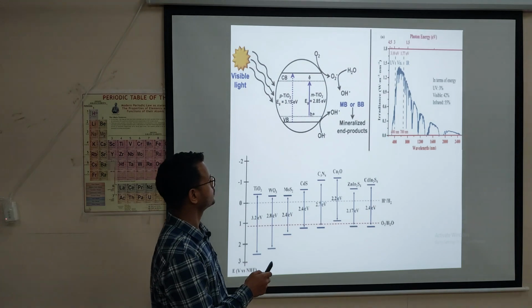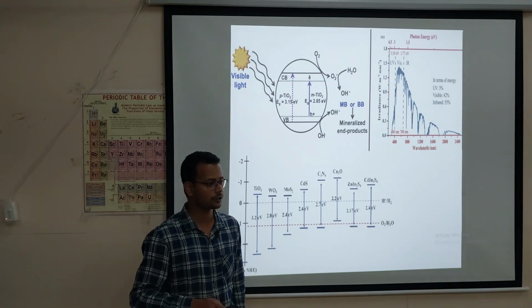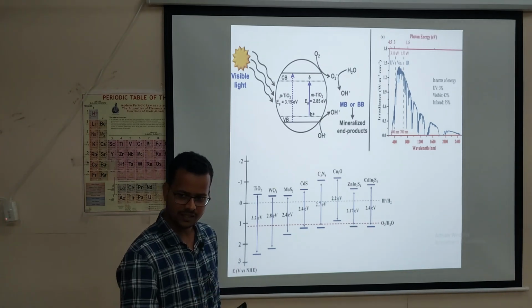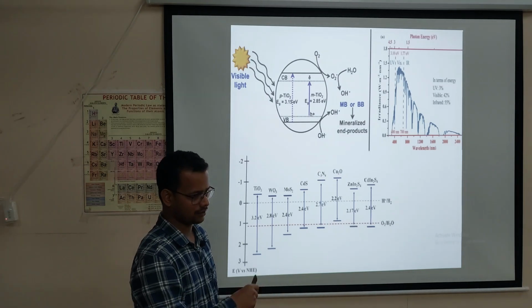Clear? That means composite formation, co-catalyst loading or heterojunction formation. By that we can increase the lifetime of the electron as well as the hole.